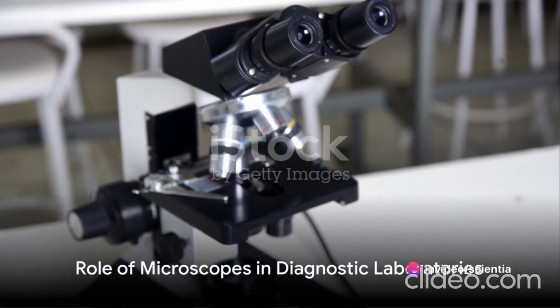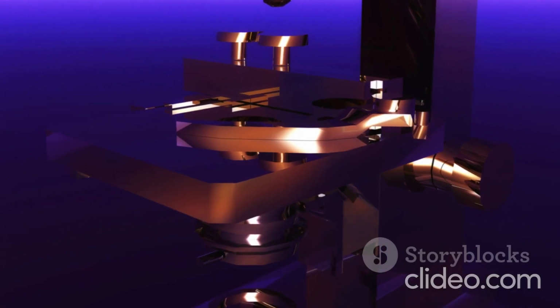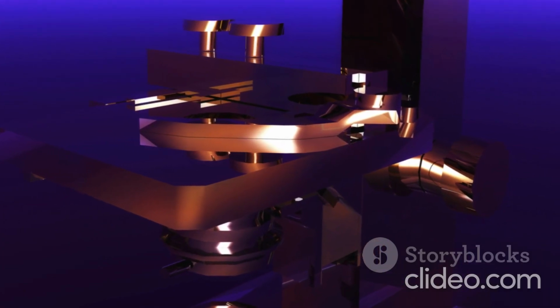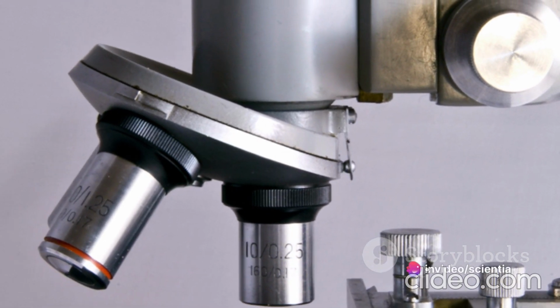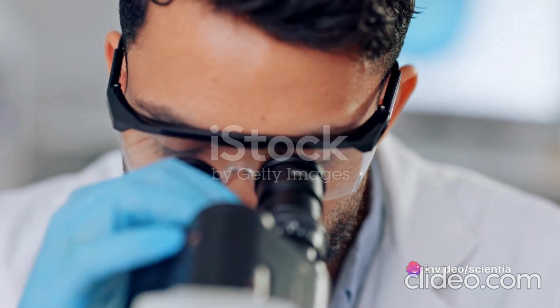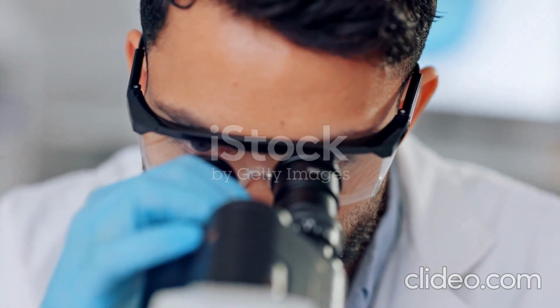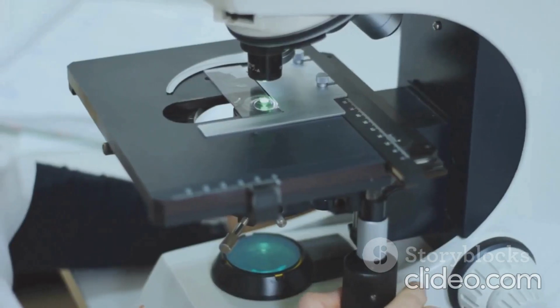In conclusion, microscopes have come a long way since their inception. From the humble light microscope to the advanced fluorescence microscope, each of these tools plays a critical role in diagnostic laboratories. They allow scientists and medical professionals to delve deep into the microscopic world, unraveling the mysteries of diseases and providing vital clues for diagnosis and treatment.